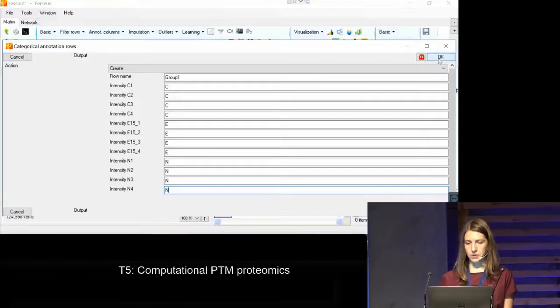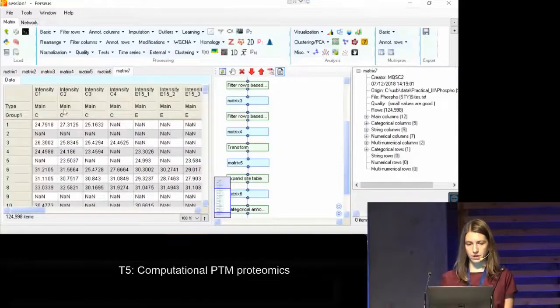Okay, I hope you're all with me. So just continue. And then you see now we have our groups nicely specified.